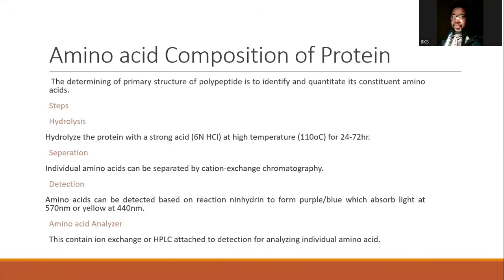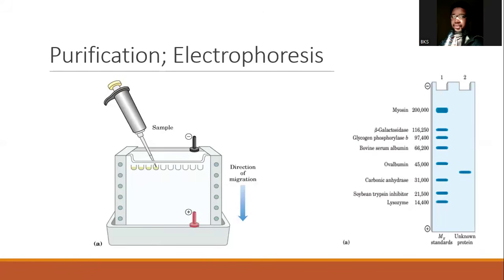So, okay, I will stop here. I will also produce another video for when you are interested in knowing the amino acid composition of this purified protein. Like I told you, you can cut out this protein from the gel and then suspend it in a buffer and carry out amino acid composition analysis. So in another video, I will talk about how you can get the amino acid composition of a protein.